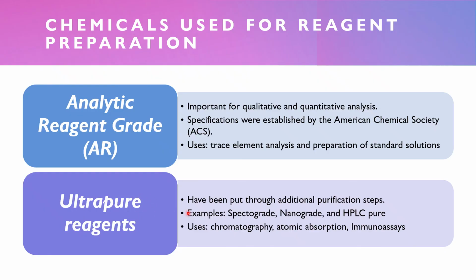These reagents may carry designations such as HPLC pure, high performance liquid chromatography, or chromatographic labels on their bottles. So that's for ultra pure reagents.